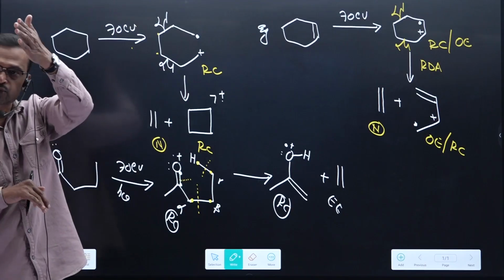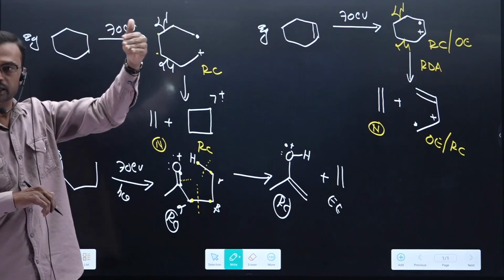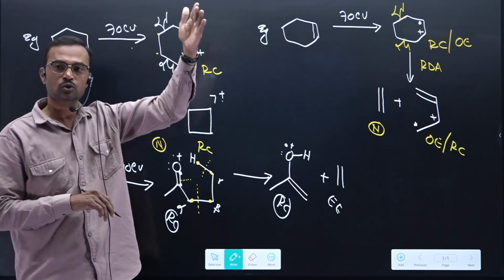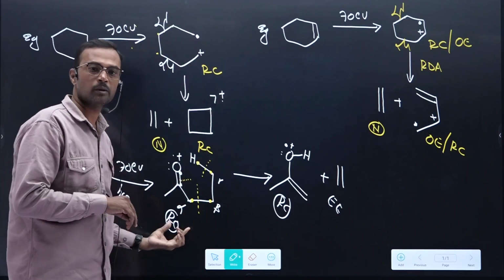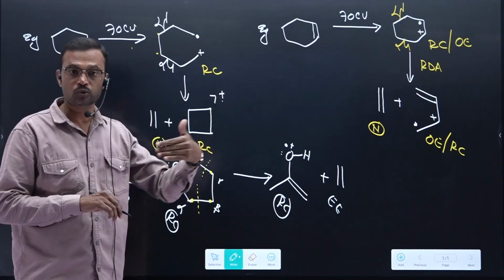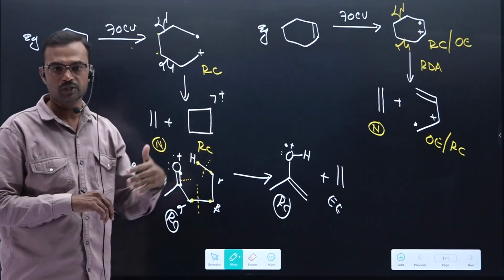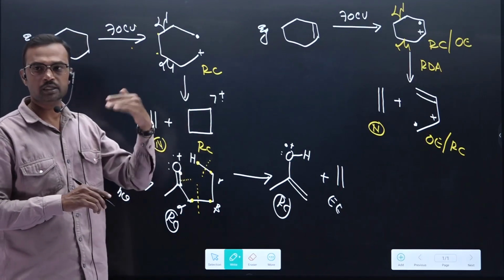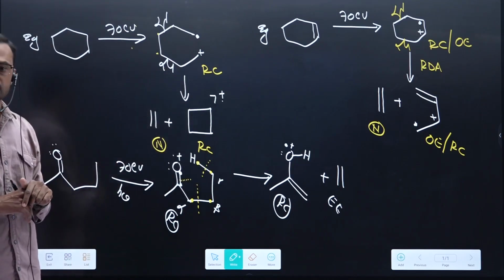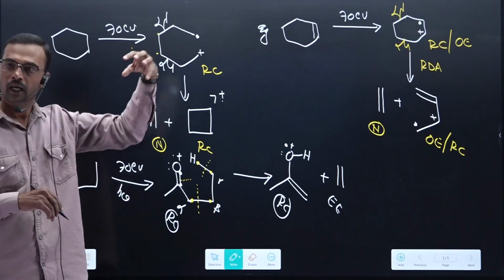Because there is a link between photochemistry and UV. There is a link between UV, photochemistry and mass spectrometry, because the two belong to electromagnetic radiations, but here it is a beam of electrons. Electron impact, MALDI, matrix, some selective sources will be there to generate a molecular ion. Those selective methods you will find in your PG, and I will explain. Matrix assisted laser desorption is a technique to generate a molecular ion.